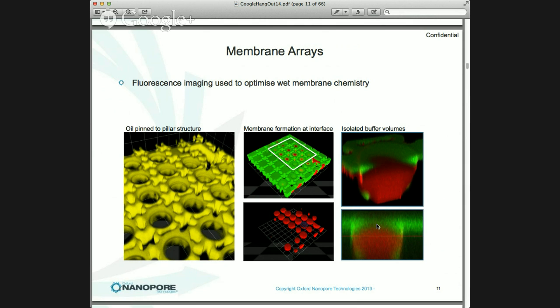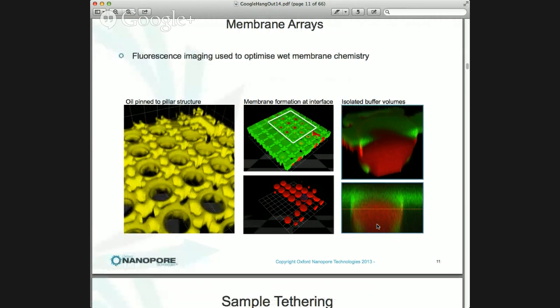Now all of that system, coupled with the membrane material itself, which is not a lipid, gives us very stable chips. And those chips equilibrate. If you make them equilibrate, they will last a very long time. And that should be apparent by now. You can FedEx those chips to people all around the world, and the pores are intact and they're runnable even for several days. So that is obviously another key thing you have to do with protein pores.